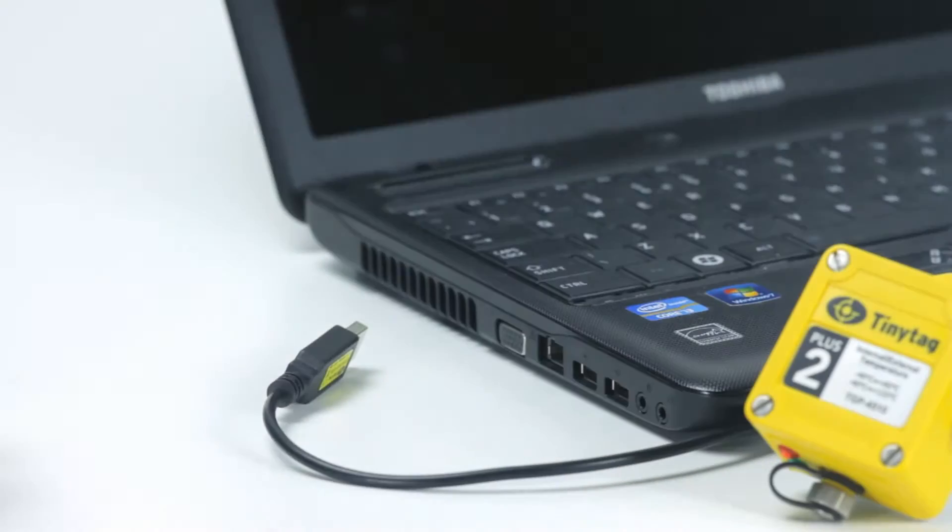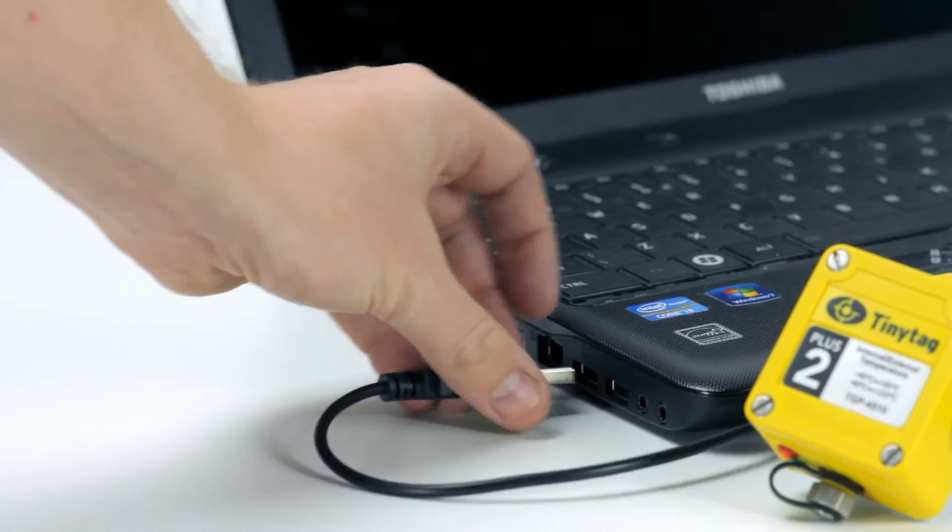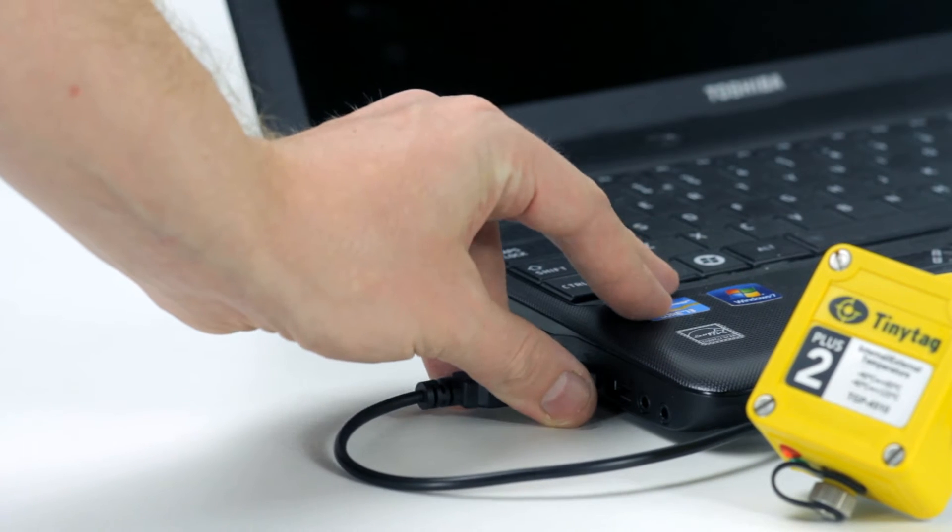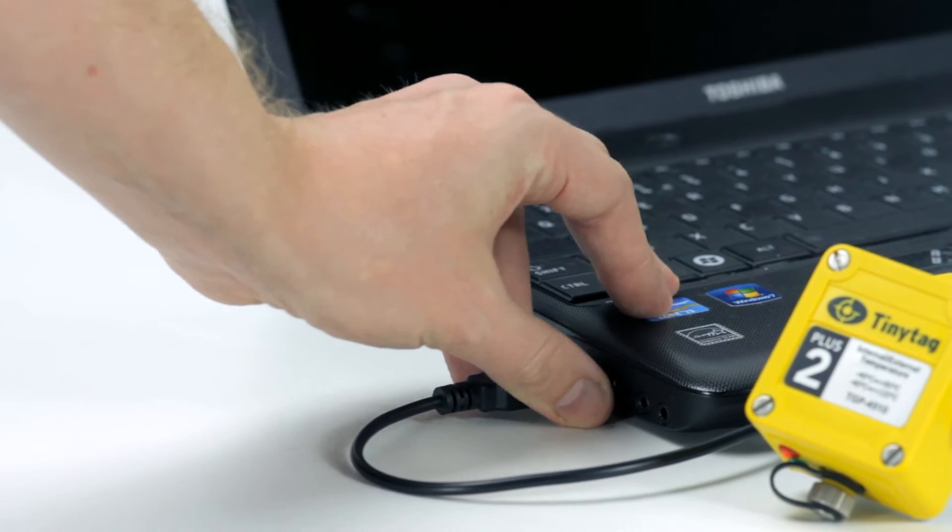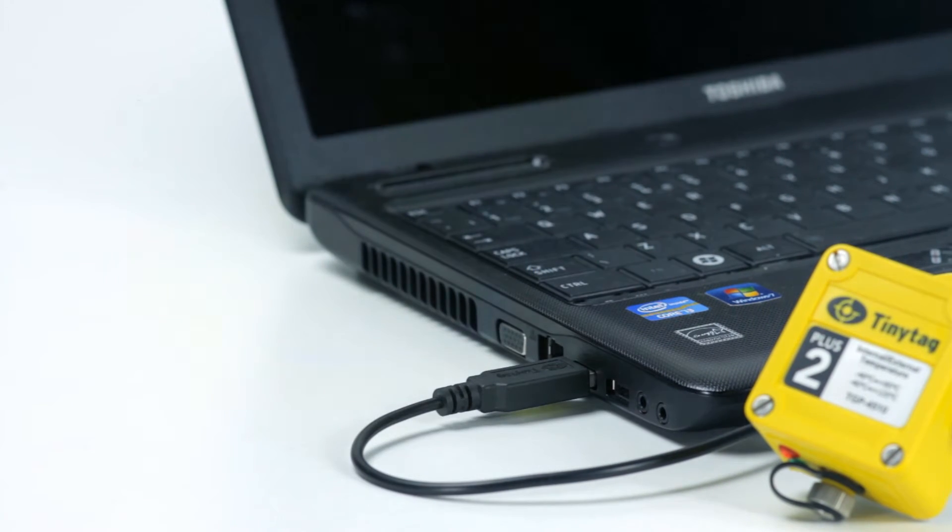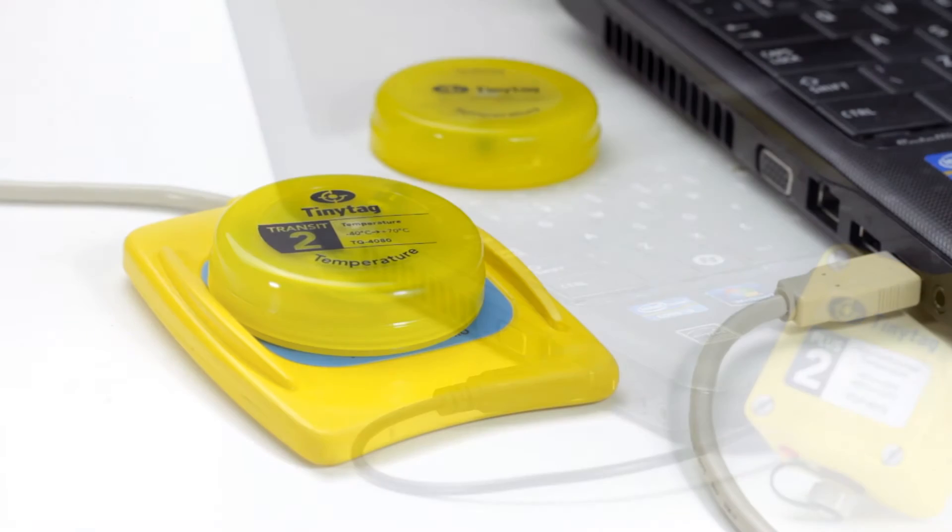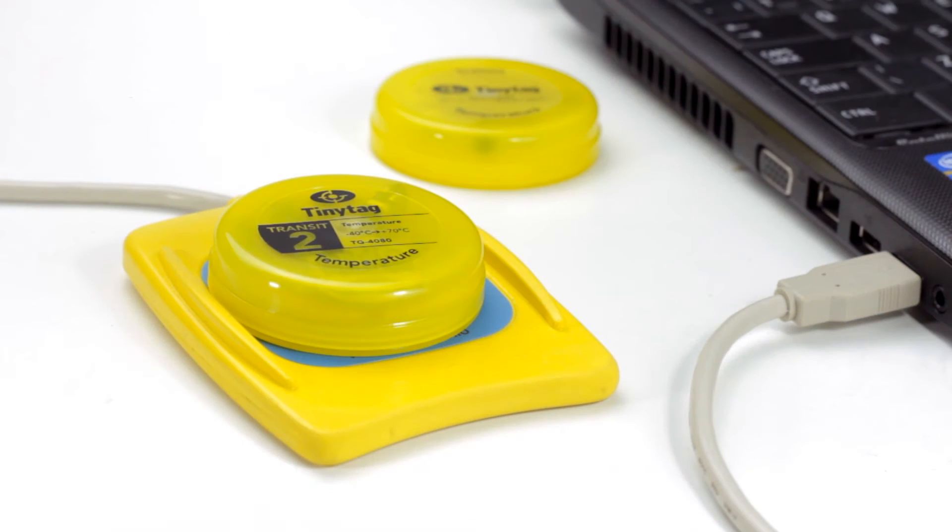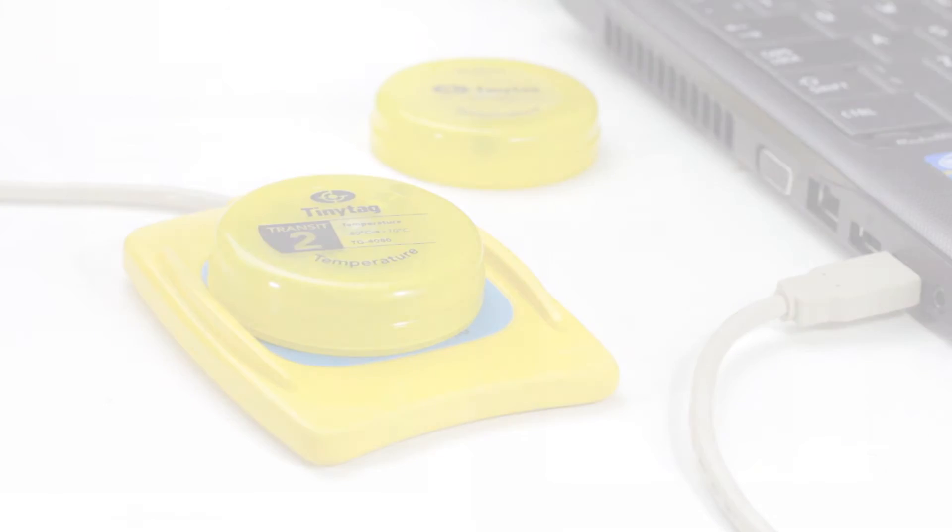Next, connect the logger to the computer. Depending on the type of logger, this is done with either a USB cable from the logger to the PC or by placing the logger on a USB inductive pad which connects to the computer.